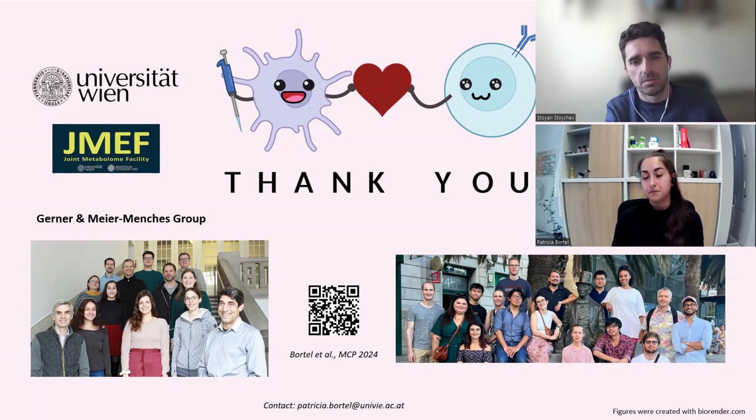Yes. Sorry to interrupt. Carry on. No, I just wanted to say that it will definitely make a difference whether you use a KingFisher or do it manually, so you always have to adjust within your workflow. And I have to say the KingFisher has quite intense washing steps and mixing. I think the RPM or the strength of the mixing is set on the highest level for the phosphopeptide enrichment, so it's sometimes tricky to replicate this in manual format. It's good that you have a workaround in terms of the additional mixing in a larger volume that works quite well.